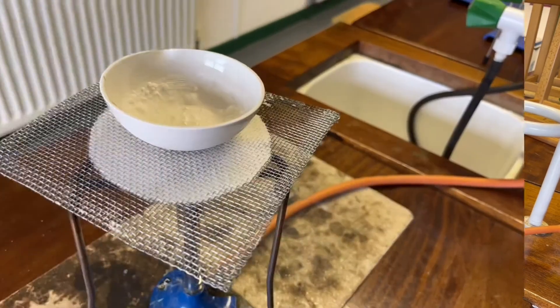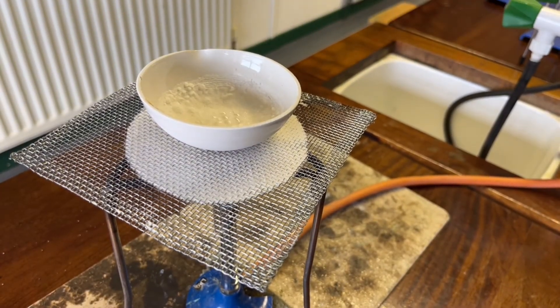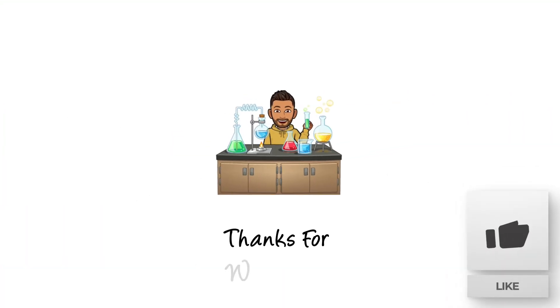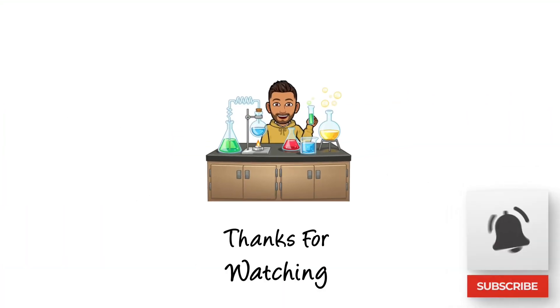What we are now beginning to see forming — this white solid — is pure sodium chloride, that was the solute dissolved in the solvent. Now that we have evaporated off all of the water, we are left with the pure solid in our evaporating basin. This method is called evaporation.